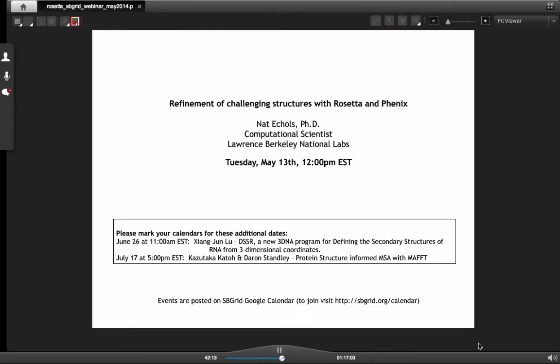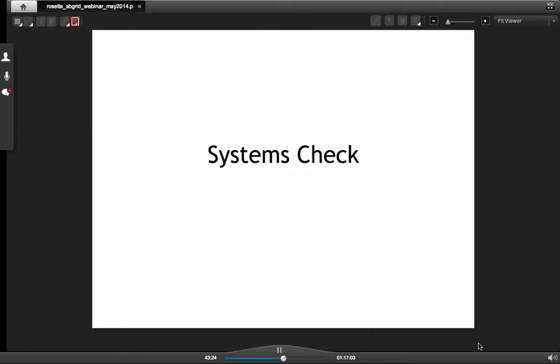So Nat is a researcher, scientist, and developer of software, the Phenix crystallography suite for structure refinement. He's at Lawrence Berkeley National Laboratory, and he's going to talk to us today about the latest developments with Rosetta and Phenix and refining difficult structures. Without further ado, go ahead and take it away, Nat.